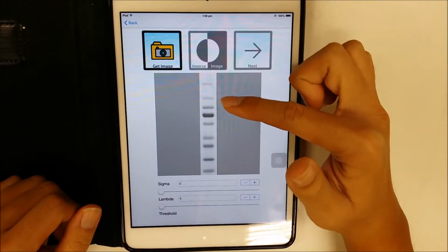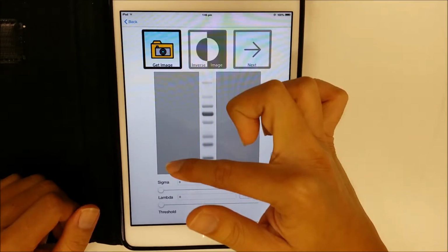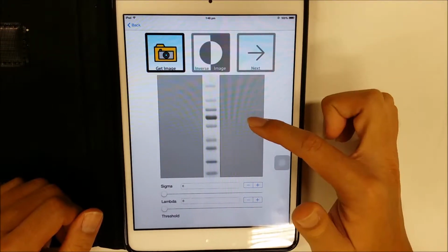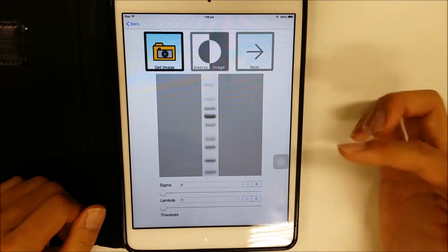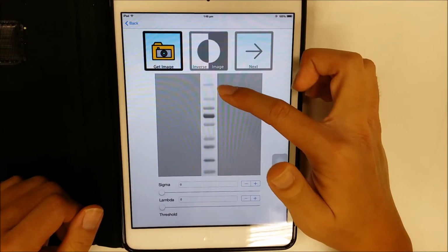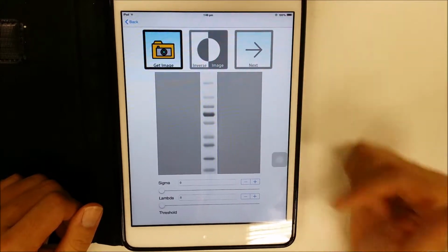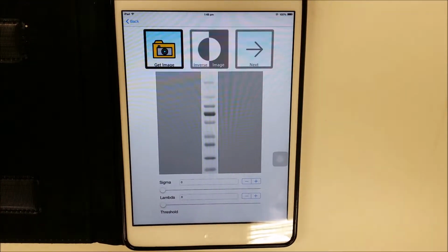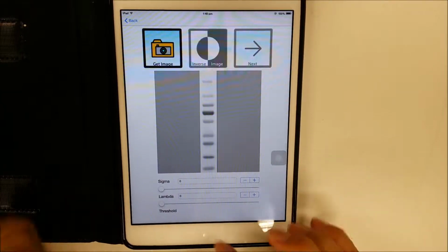When selecting a marker standard image for the calculation in GelApp, try to use an image from the internet because it's of the highest quality and it is easier to detect the bands. It must be pre-cropped in order for this function to work.